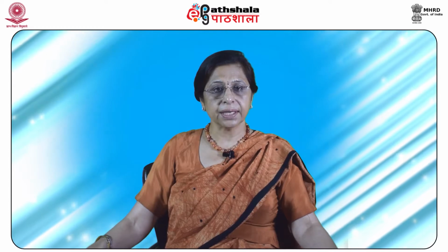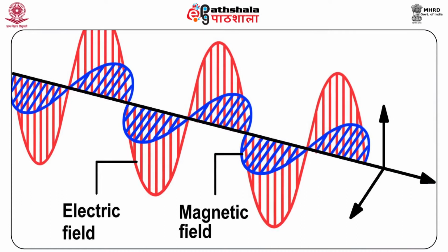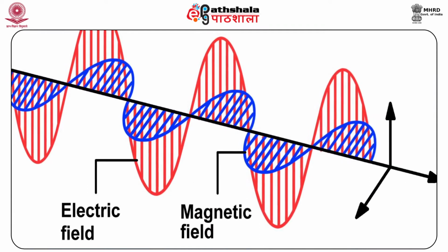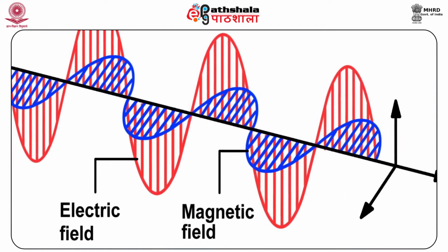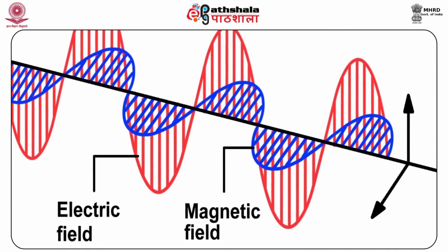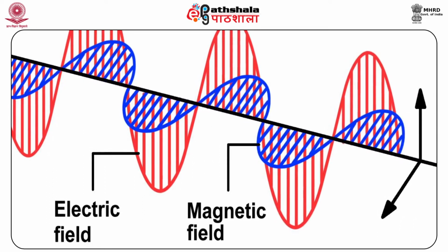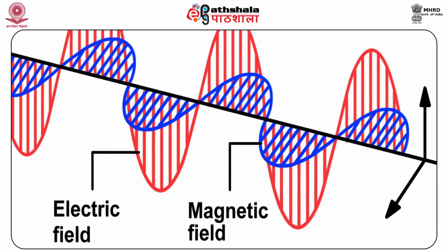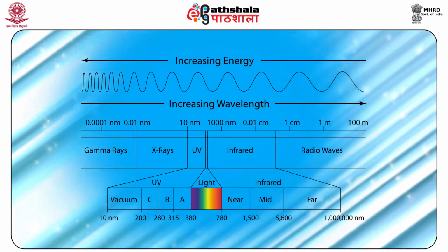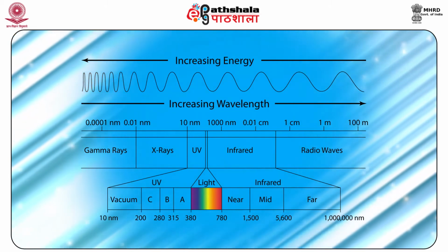Now, next is nature of the electromagnetic waves. As you all know, these are the waves that involve both electric and magnetic components which give rise to their common class name, electromagnetic radiation. In spectroscopy, only the effects associated with the electric field component of the electromagnetic waves are important. The whole electromagnetic spectrum is shown in figure 1.